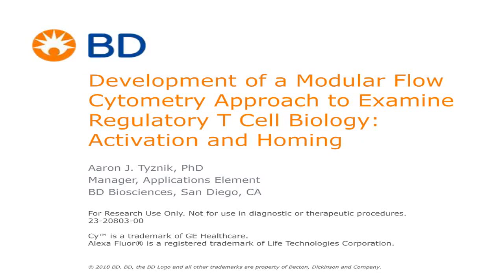So as Belinda mentioned, I'm a manager in the applications element at BD, and I'll be talking today about the utility of a modular regulatory T-cell panel and the application of it in a high-dimensional analysis. We're going to go through the process of designing panels to accommodate all the needs for your particular requirements for your specific assay. And for us, we're interested in looking at regulatory T-cell biology and the activation and homing specifically.